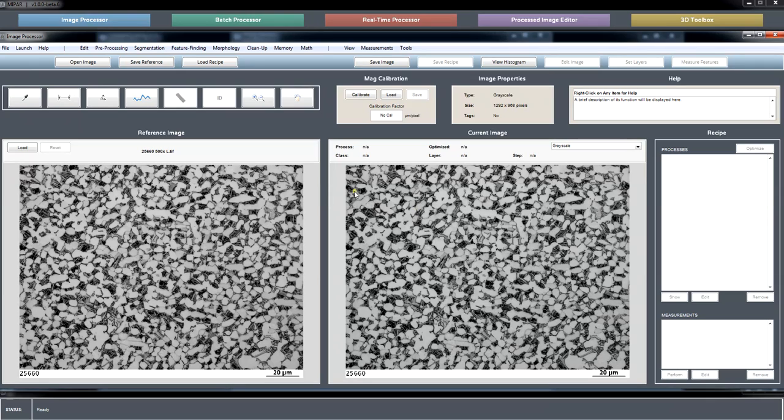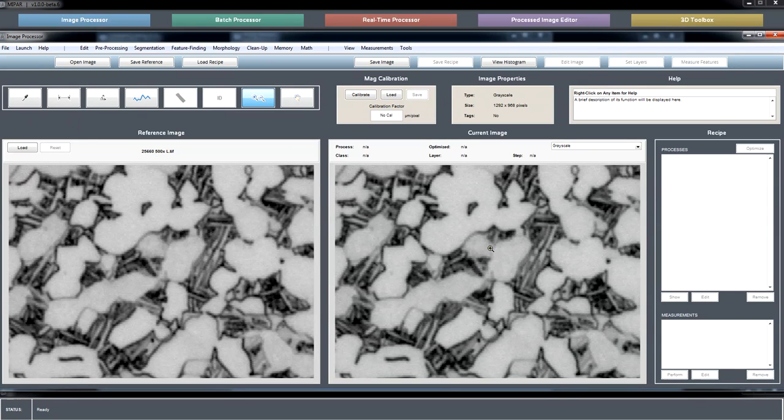Okay, so this is a bimodal titanium microstructure, so this ties in, I guess, to the 6th place topic, which was distinguishing different microstructural features. Here we have 2 different morphologies of titanium, or the alpha phase of titanium. So these are alpha laths.